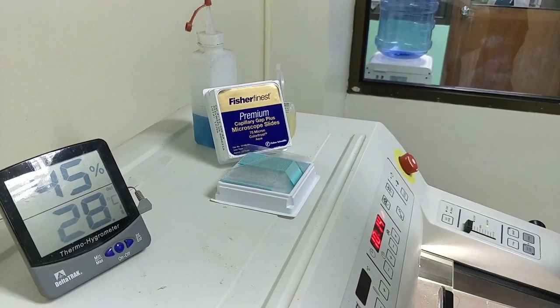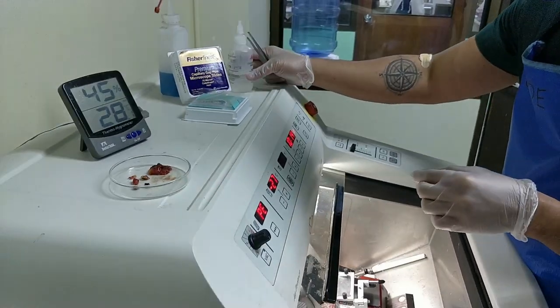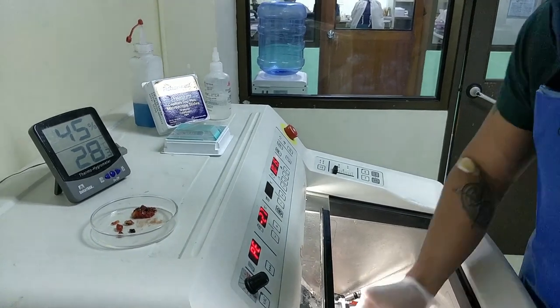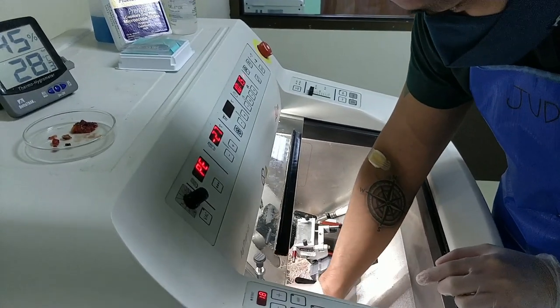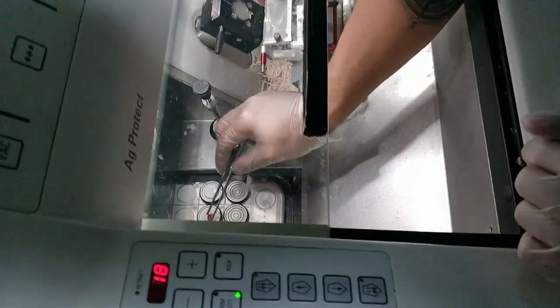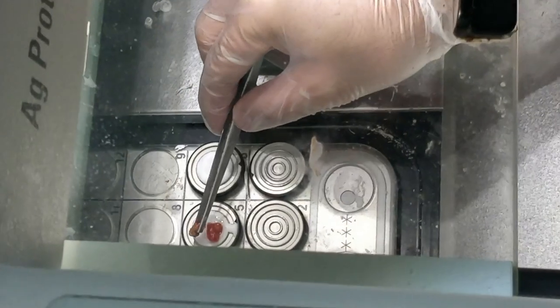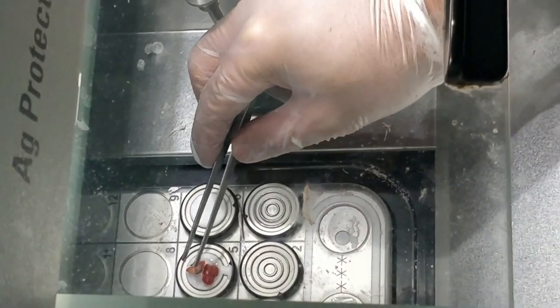So, the ideal slides for frozen section are charged slides, no? They have, by the name itself, charged. So, after the partial freeze of the freezing media, we can now place the specimen.